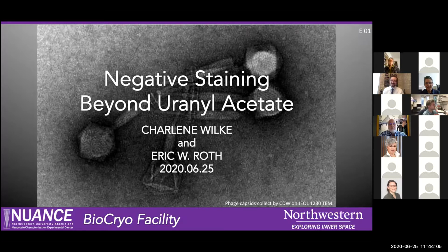So we're trying to work with them to find out just how we're going to move forward with that, if we're going to allow people to do that in our space. But usually you'd have to do a liquid waste container. If you're talking about even in your own lab, they have liquid waste containers, and then you'd submit a form for pickup of radioactive waste. I do have liquid waste in the hood in B540.